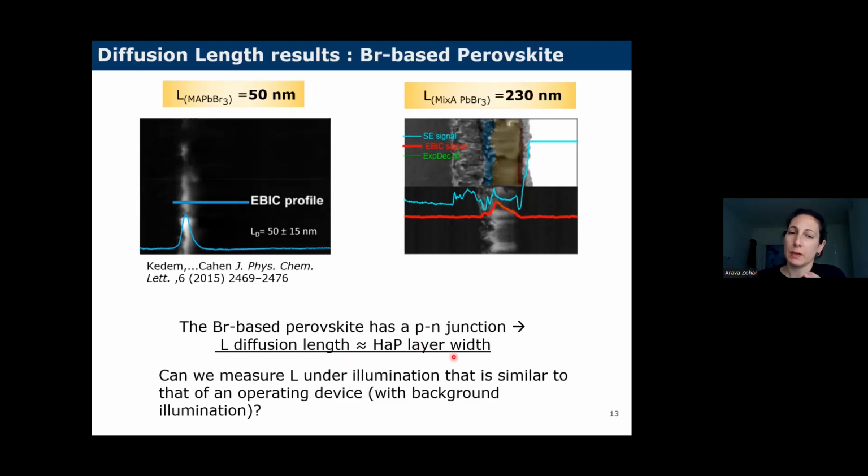And now we stop for 1 second and we say, okay, when we use the electron beam current, we locally excite our carriers. But what if, in a solar cell itself, I'm illuminating the whole sample and then the population of the carriers changes just because the radiation is different? Could it affect, in a real solar cell, the diffusion length of the carriers?